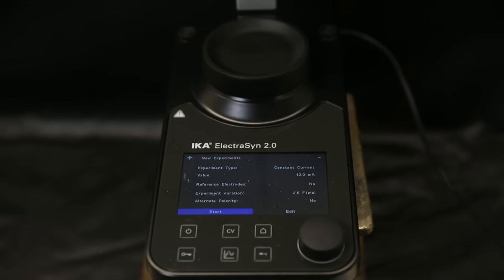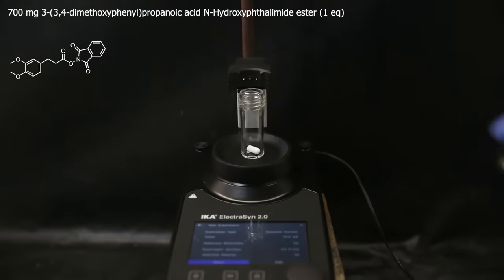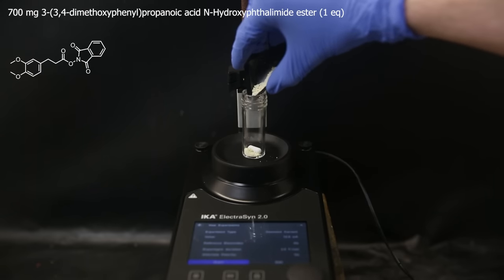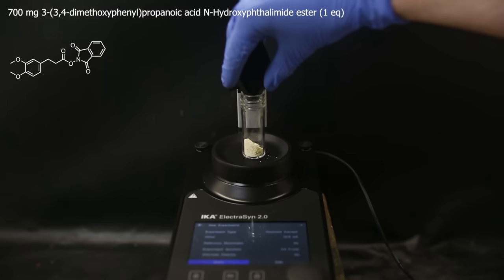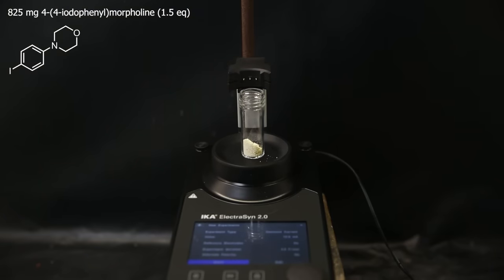So that was it, now it can be started. But first, I have to prepare the reaction mixture in the vial. So I set up the vial and the stir bar that comes with the device and add in 700 mg of the redox active ester I just made.